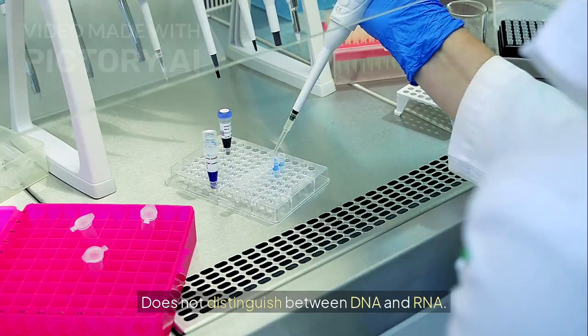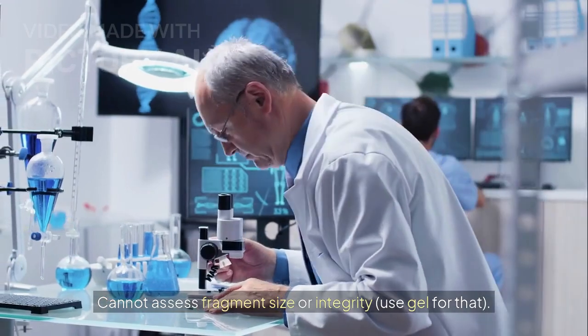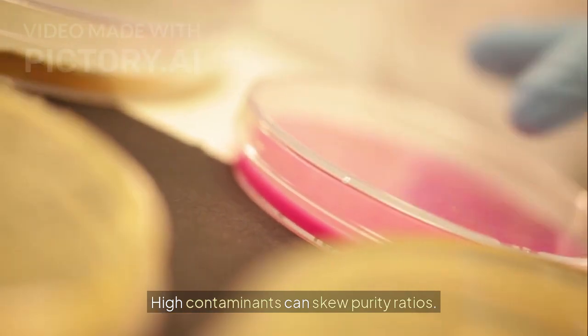Limitations: it does not distinguish between DNA and RNA. Cannot assess fragment size or integrity; use a gel for that. High contaminants can skew purity ratios.